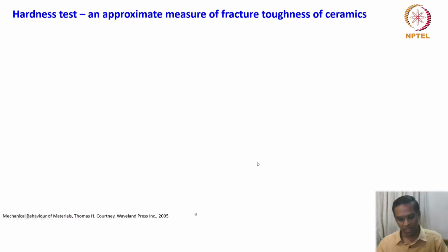Okay, so now having described the very sophisticated hardness methods, how hardness measurement is useful in finding out something else. So the hardness test is an approximate measure of fracture toughness of ceramics. So the fracture toughness is measured by just measuring the hardness in ceramics.